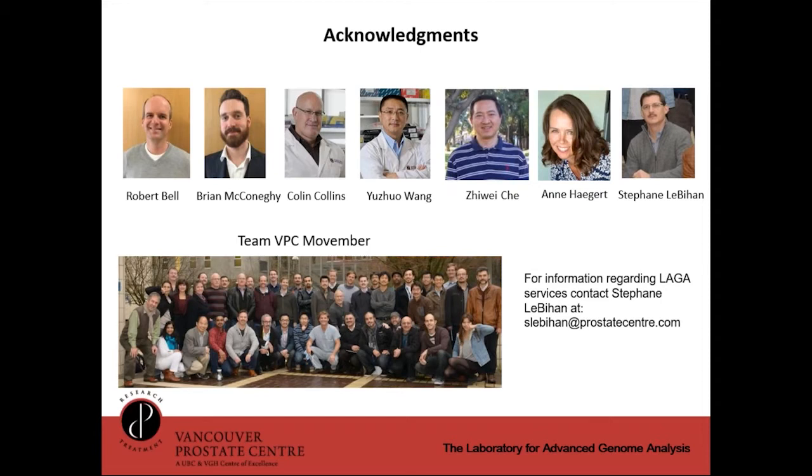Another question: did you confirm the NGS results with array results for each sample? No, we had new PDXs put in there, so we only had confirmation with maybe 6 out of the 21 that we had. Oh, and actually that primary was done in a PDX as well. So I'm going to say maybe 7 or 8 we had array CGH for.